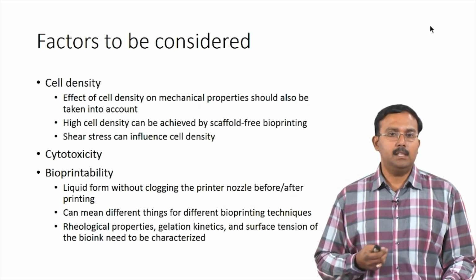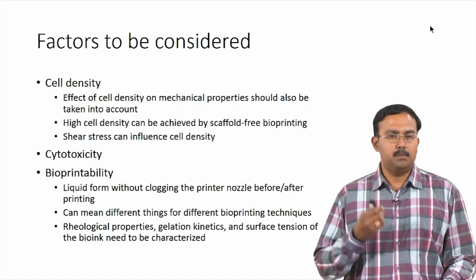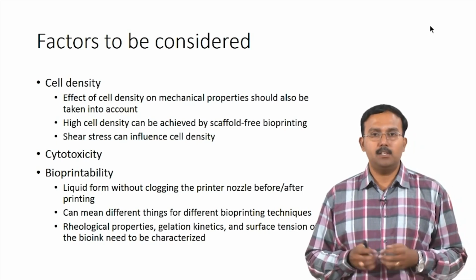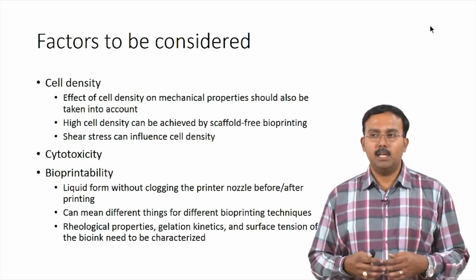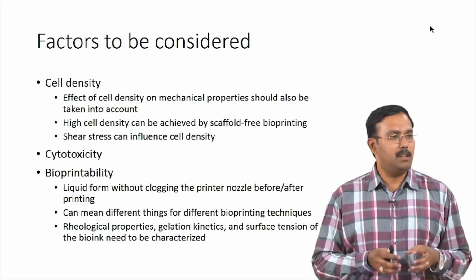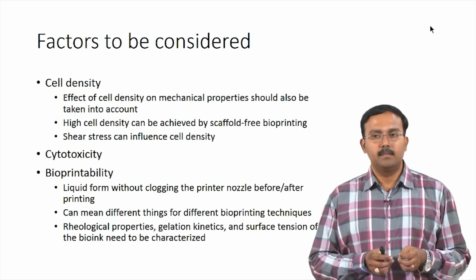Another thing is this printability itself can actually mean different things for the different techniques which are being used. So, we will talk about the techniques. While we talk about the techniques, we will talk about what exactly would be a printability for that specific technique.